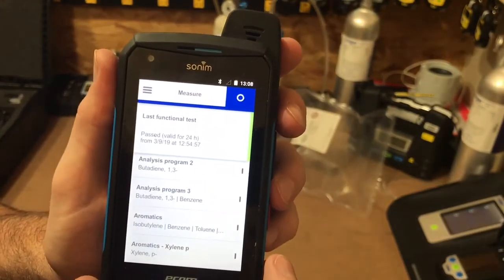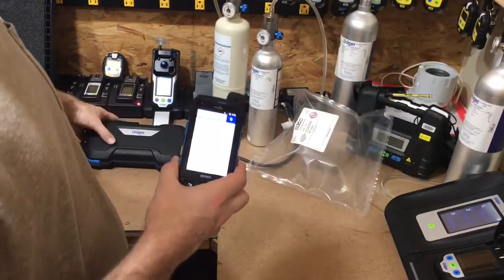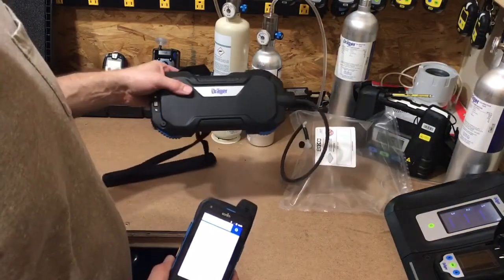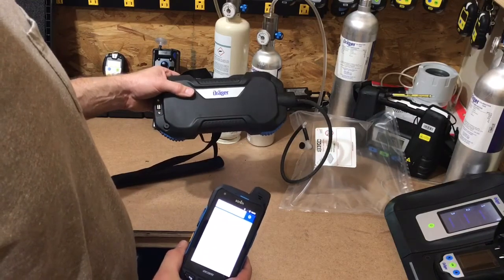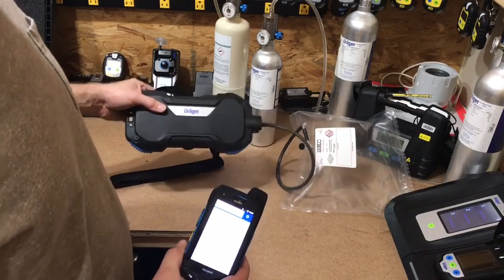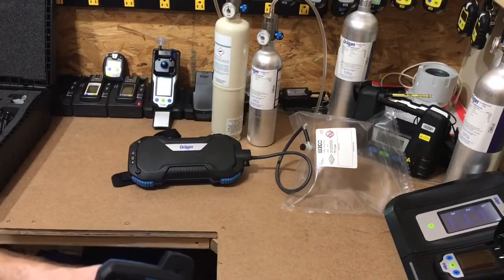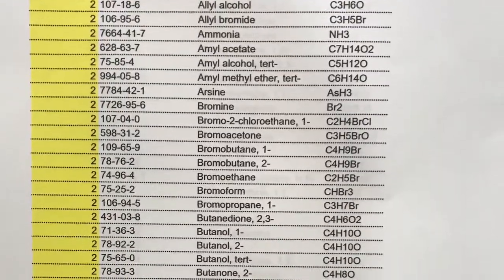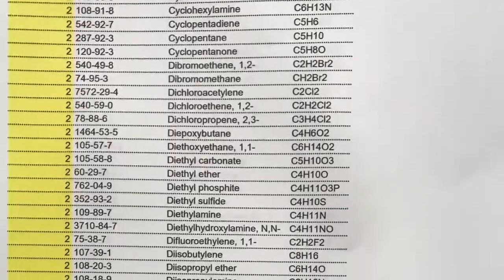And that's how fast you can do it off the bag or in the field with the new Draeger XPID gas chromatograph — rated for hazardous areas. Here's a snapshot of the 265 additional compounds that can be qualified.